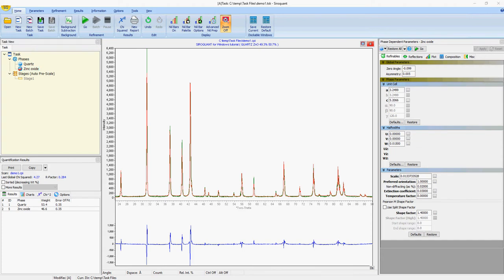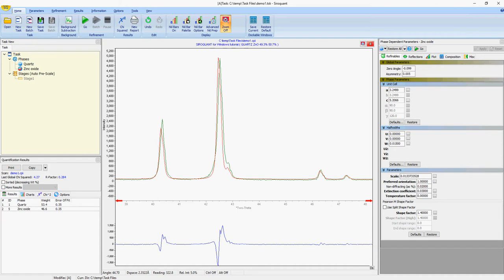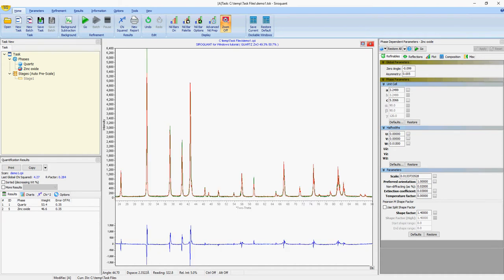When you want to zoom into a particular region in SARAquant, you do that by clicking and dragging down and to the right, and that will perform your zoom. And if you want to zoom back out, you do the opposite. You click and go up and to the left and that will zoom out.